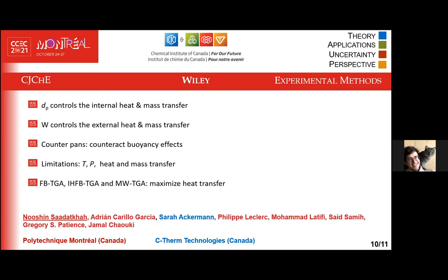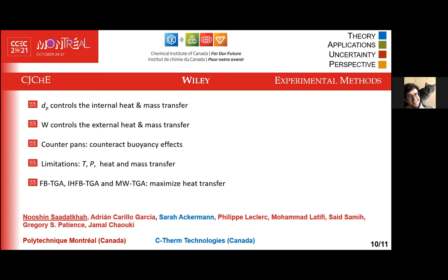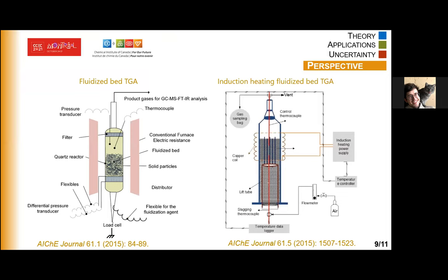Very interesting, this fluidized bed TGA. I didn't know that those things existed. I don't quite understand, so how does it work? Do you have an inert fluidized bed and you put the material that you want to analyze as part of that fluidized bed, or is the material fluidized itself?